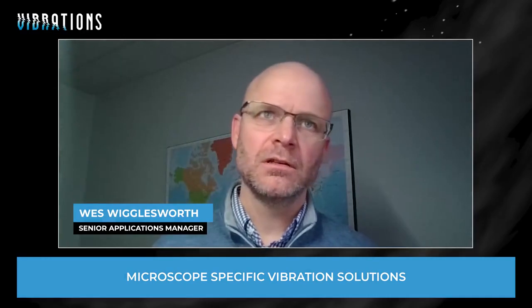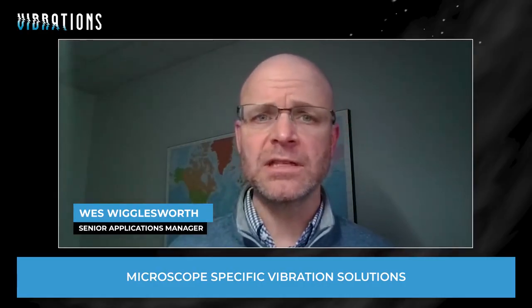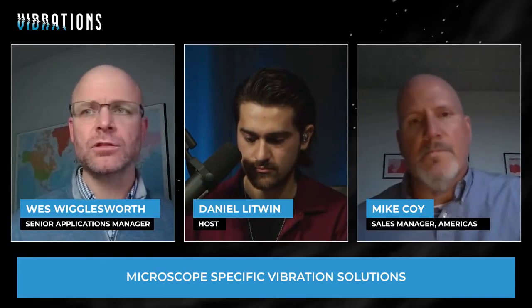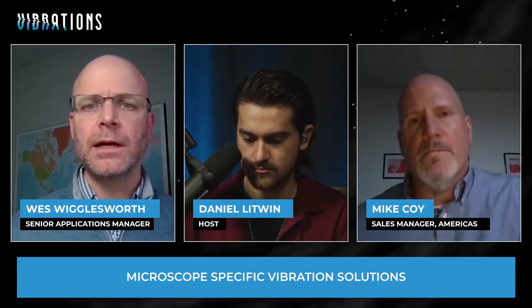Yeah, Mike, you might know from actual user experience, but I always say, the earlier the better. At least consider it at the time you're considering which microscope to purchase, but sometimes even sooner. Like Mike said, the microscopes are getting more and more sophisticated. Some of these large TEMs, clients are designing facilities that are purpose built for that microscope.